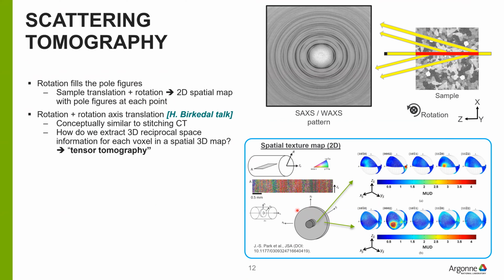In this case, you have a sample that was cut from a titanium piece that has this classical stringer microstructure, or stringer preferred orientation, with the C-axis pointing in some direction that it likes because of the processing path.